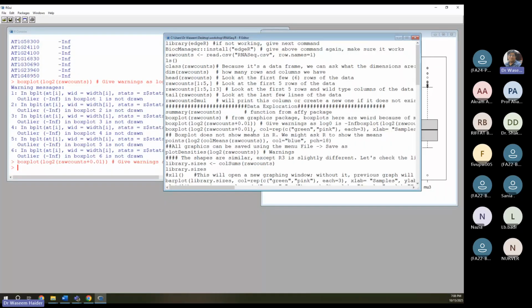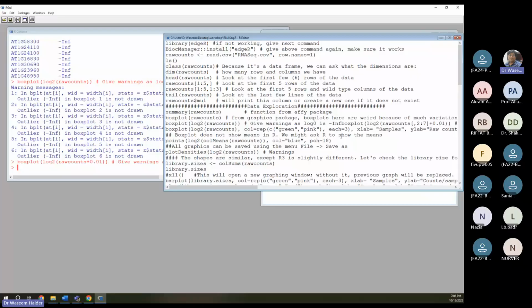So we ignore that. We don't add that constant. And then here I'm adding different options, different flavors. Within those fries, I'm adding ketchup and the mayonnaise and whatever, right?